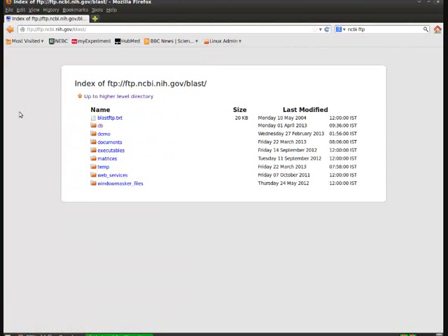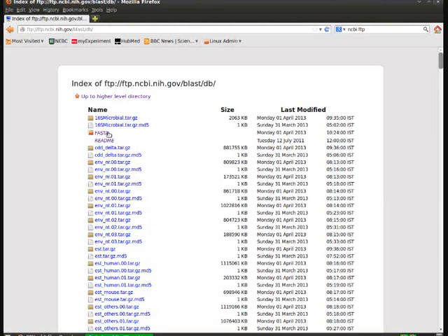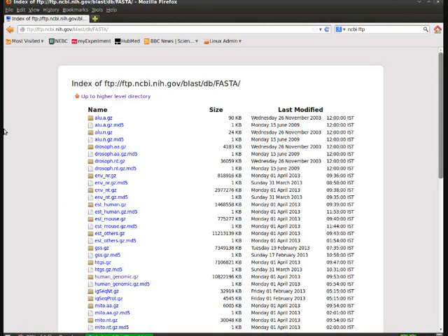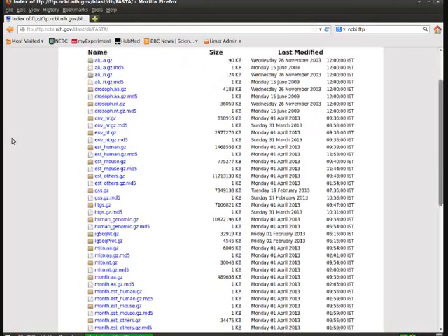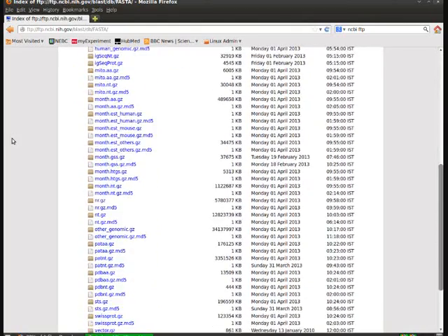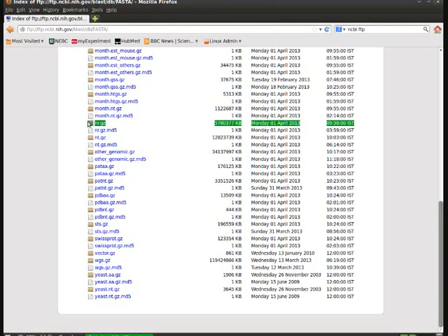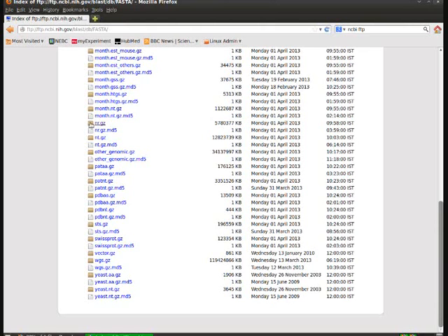Click on the folder called DB, then into the folder called FASTA. You can also download the readme file for your own sake. If you scroll down you will find a word called NR. You can see from the description it is nearly 5 GB and it was updated Monday, April 2013. It is an example set of non-redundant sequences.